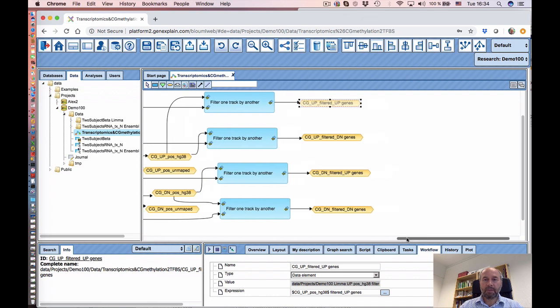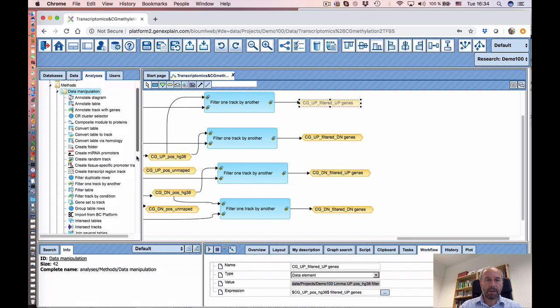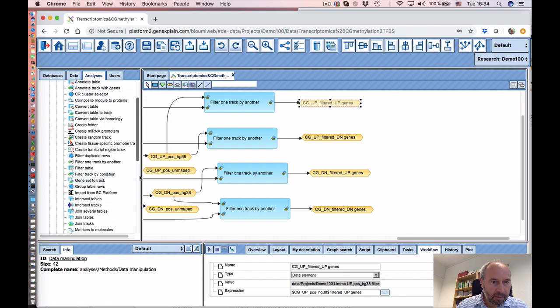To do that, we have to extend these positions into areas, adding some regions left and right around those positions. To do that, we have these new methods which can do that. So we basically take a method called modify, or just let me check.